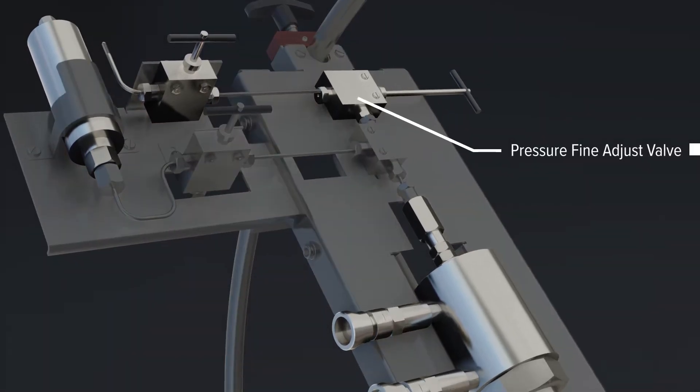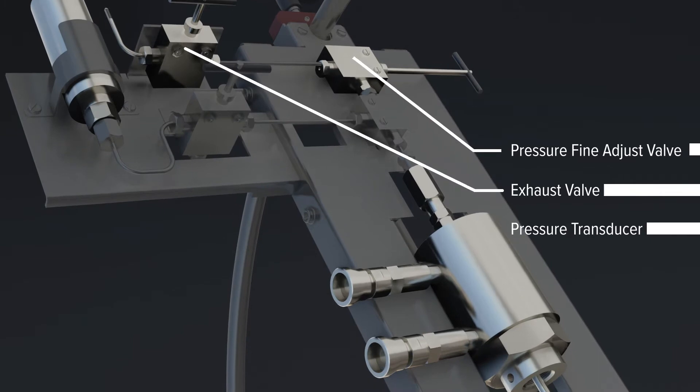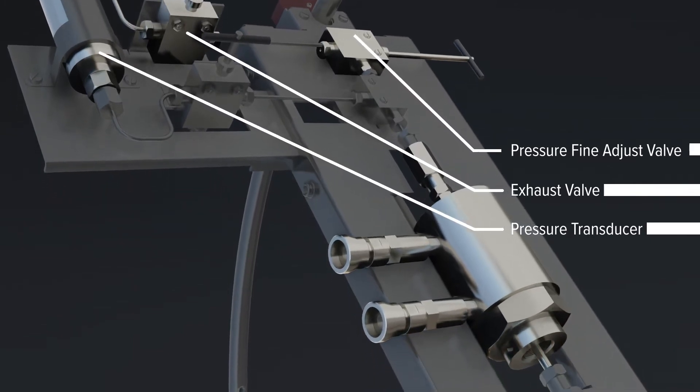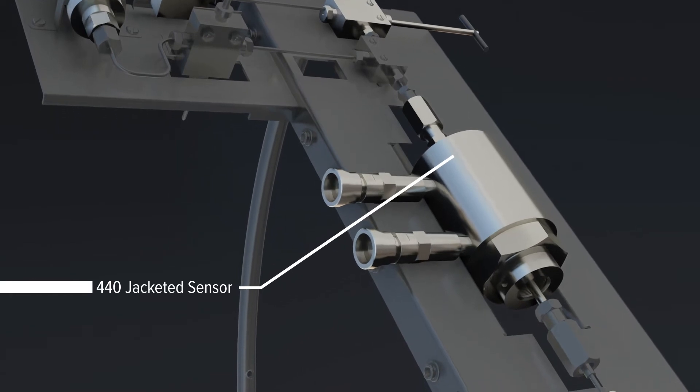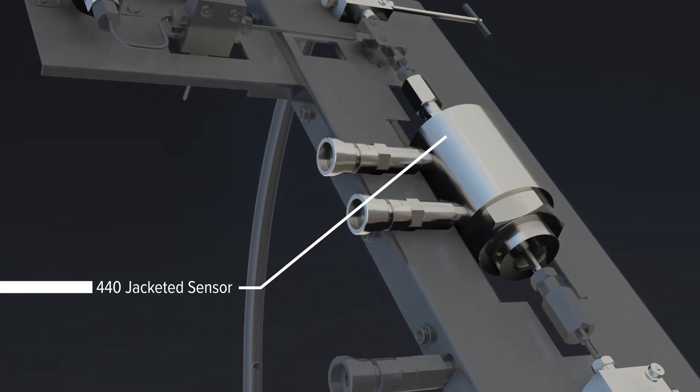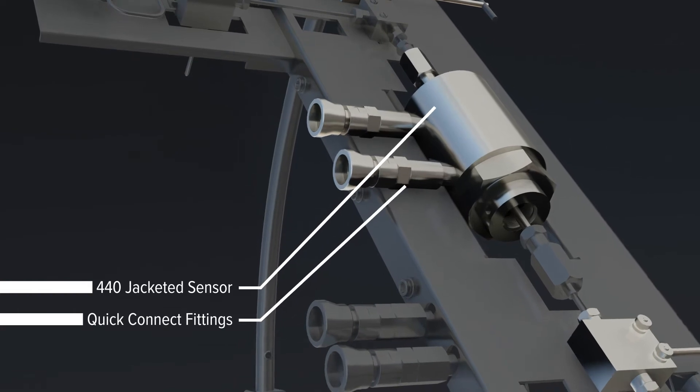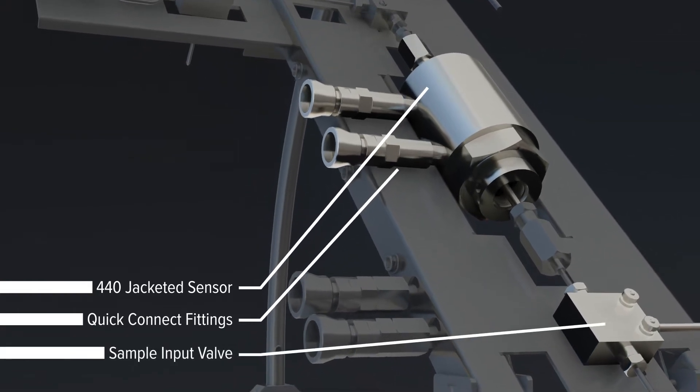The platform has an integrated pressure transducer and can reach thermal stability in under 30 minutes using our integrated recirculating temperature control bath with quick connect fittings. Low torque gland allows for quick assembly. Pressure generators can also be provided.